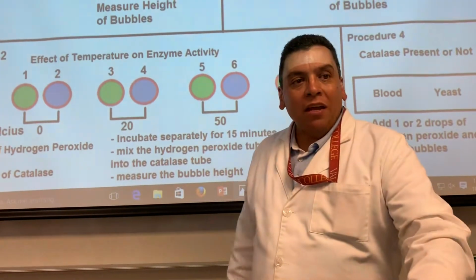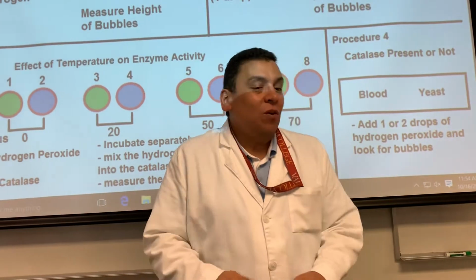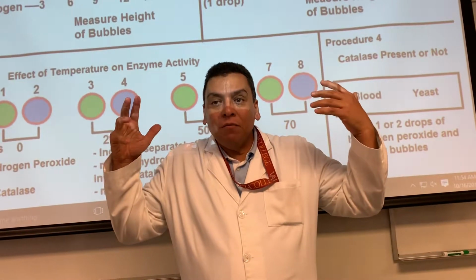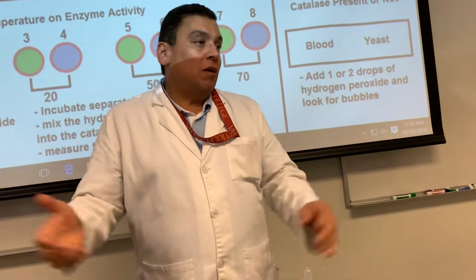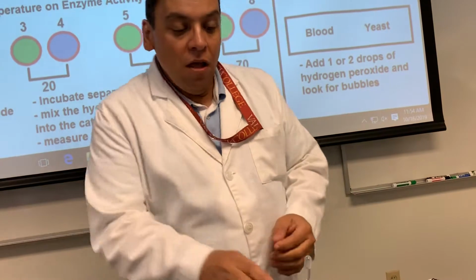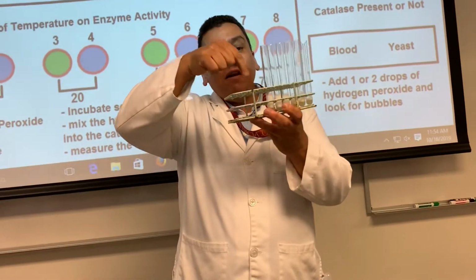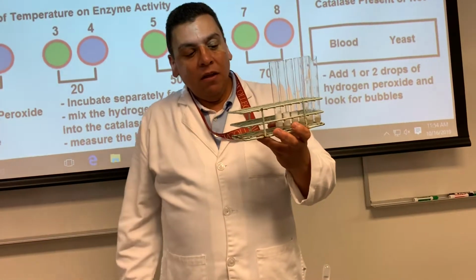Well, that's the same thing. The enzyme gets overwhelmed, but we don't call it overwhelmed enzyme. We call it saturated enzyme. Beyond a certain point, it can no longer help you because it's doing its job at the maximum capabilities that it can. It can't help you anymore. Unfortunately, we don't have that yet in today's data. It's almost saturating, but had we done 3 more, it would have leveled off. All right?